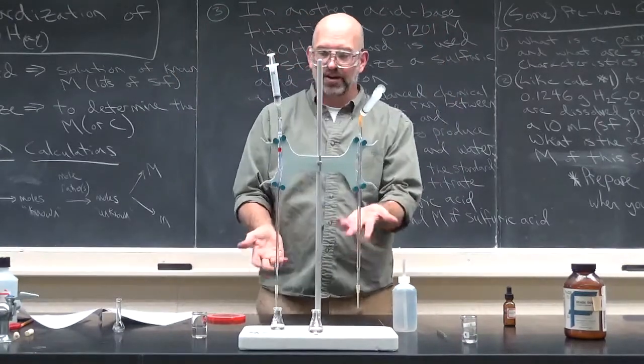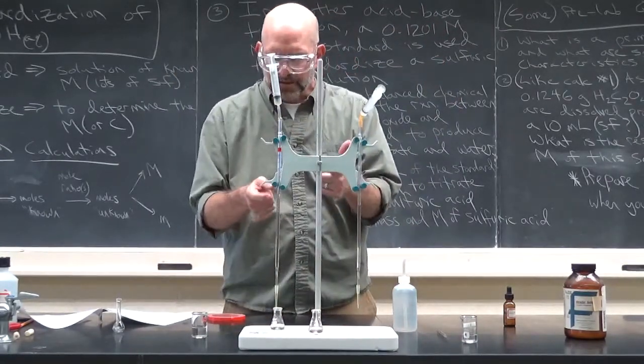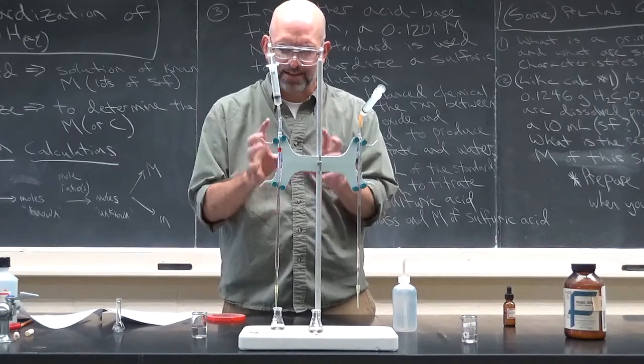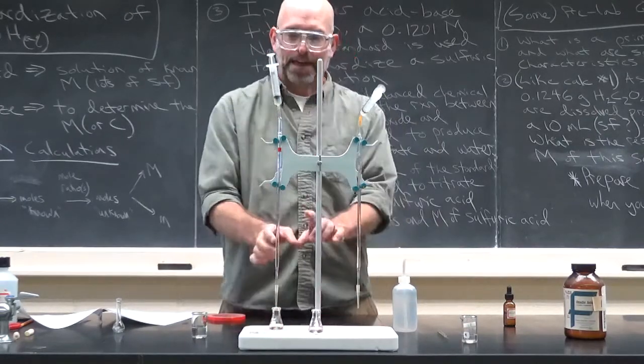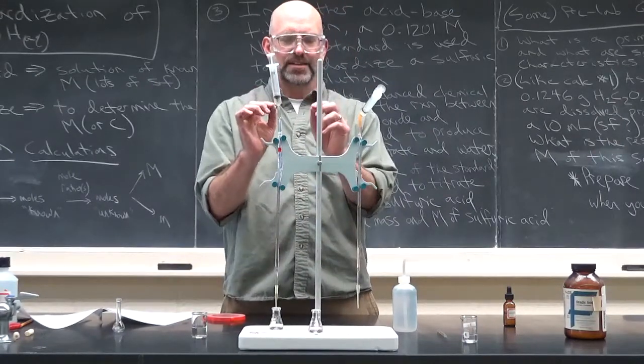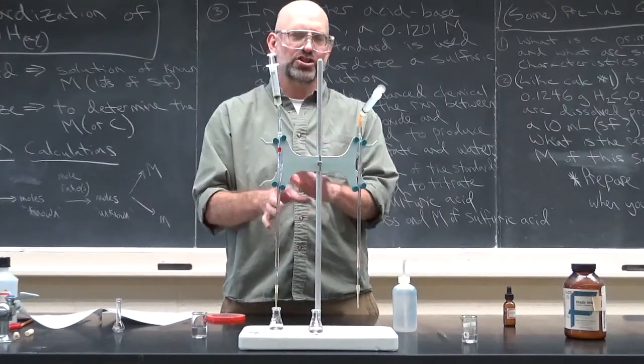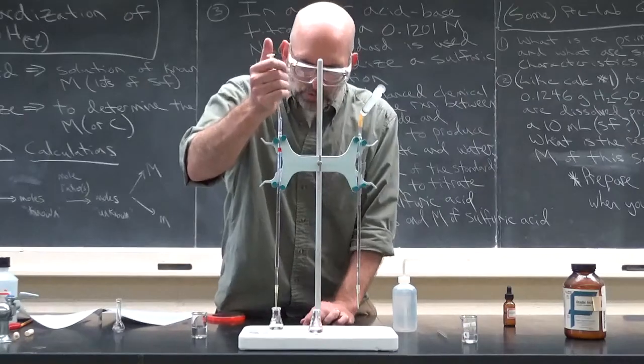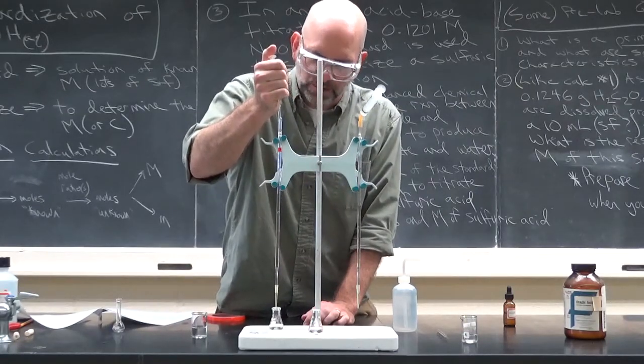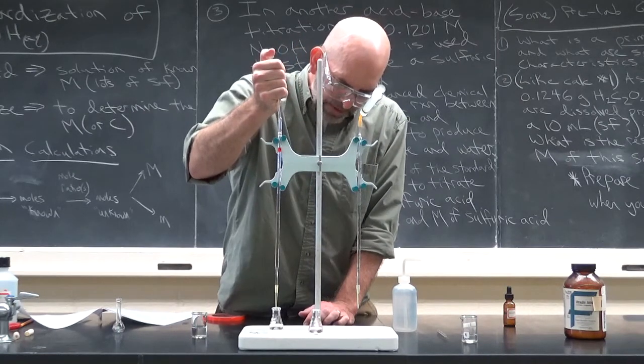Okay. A couple things could go wrong here is sometimes it's really hard to see that pink, slight pink color. The goal you want is for that pink color, very faint, to remain in the solution for a period of time with the addition of one drop. So when you get really close, the pink color will linger. I'm going to add one drop. Let's see what happens.